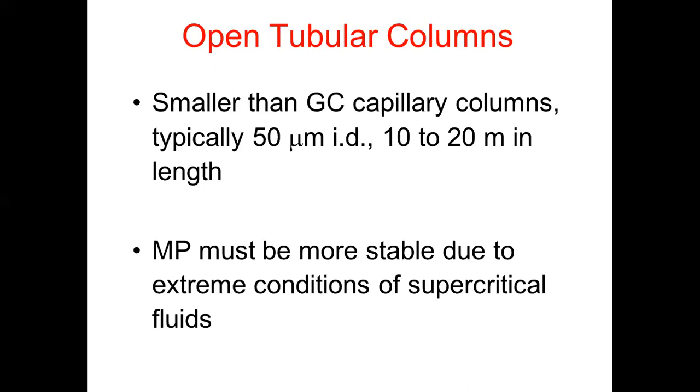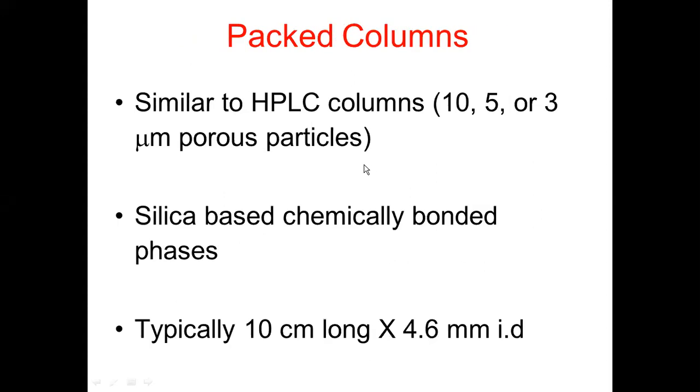We will be raising the pressure and the temperature in order to attain the supercritical fluid state. While doing so, the composition of the mobile phase should not be changed; it should be intact. As a result of these advantages, the columns give highly excellent results while performing the separation in the supercritical fluid chromatography technique.